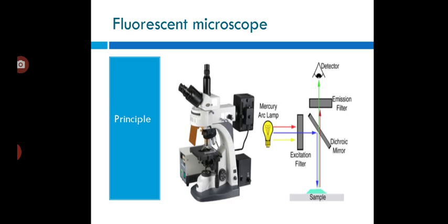Fluorescence microscopy uses a much higher intensity light to illuminate the sample. This light excites fluorescent species in the sample, which then emit light of a longer wavelength. The image produced is based on the second light source, or the emission wavelength of the fluorescent species, rather than from the light originally used to illuminate and excite the sample.